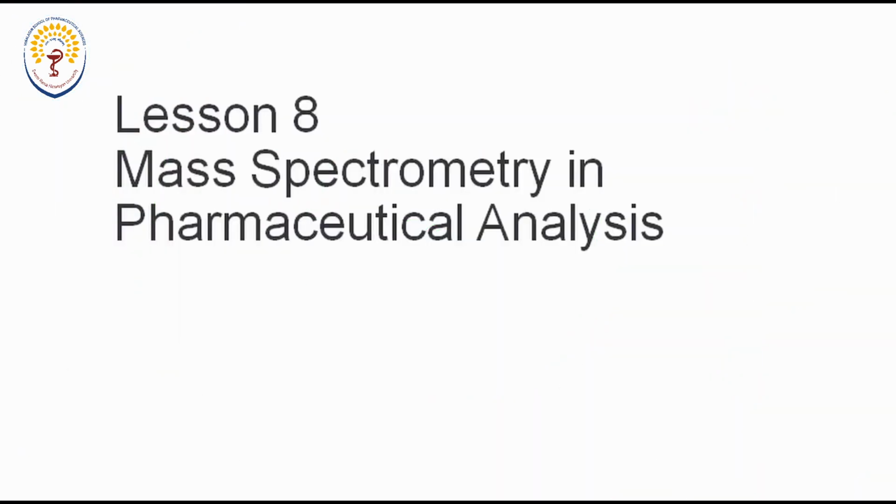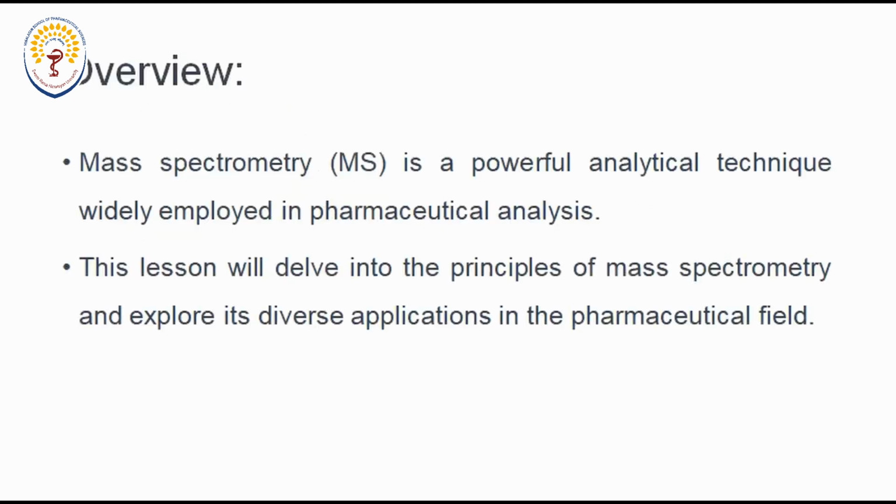Lesson number 8, Mass Spectrometry in Pharmaceutical Analysis. So dear students, in this lesson we will study a different kind of technique. This technique is known as mass spectrometry. In the previous video I told you the difference between spectroscopy versus spectrometry. So then what is the difference between spectroscopy and spectrometry?